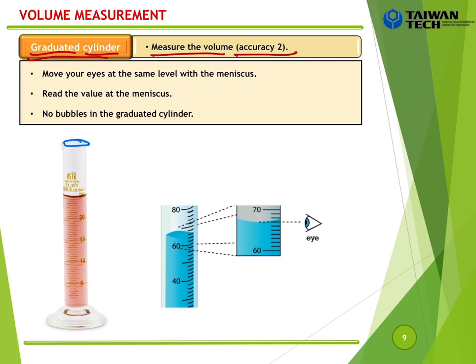Okay, and from here you can see it depends on the device as well. So if you have the level here 5, this one is 10, you can check the levels inside, right? So 5 means that you have one level in the middle, 2 levels, 3 levels, 4 levels. So this one at the beginning we have 5 here, right? And this one will be 6, this one will be 7, this one will be 8, and this one will be 9.